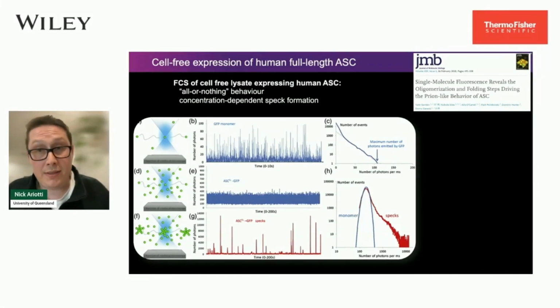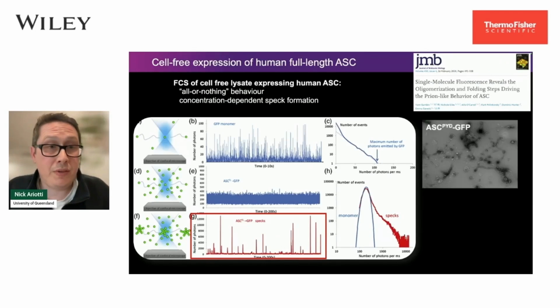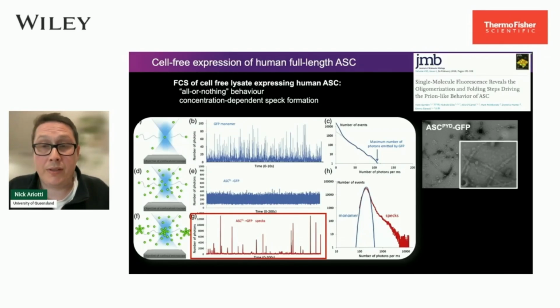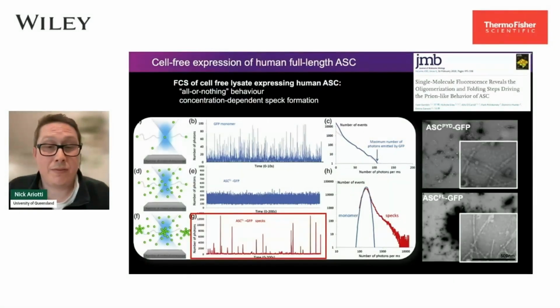So we wanted to test this, so we went through a negative staining protocol, and we showed that the pyrin domain, GFP alone, resulted in significant filament formation. I hope you can see that there. We also showed, as we zoom in, that these filaments look very normal relative to what other people have generated previously. But critically, when we express the full-length human ASC in this system, we form these very dense uranyl acetate-rich structures that when we zoomed in, we could resolve extensive filaments protruding from the edge of these domains.